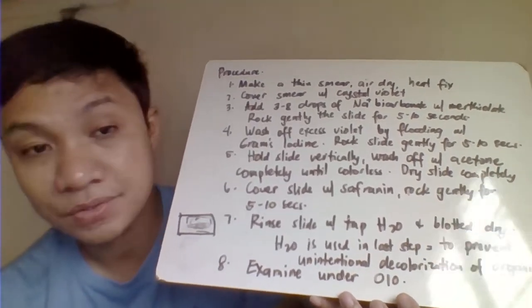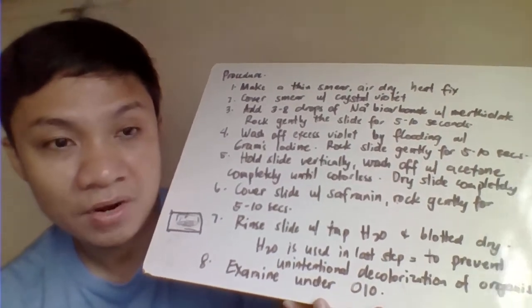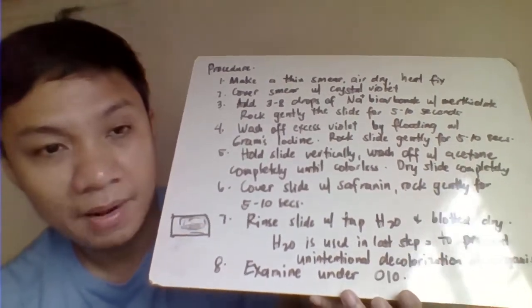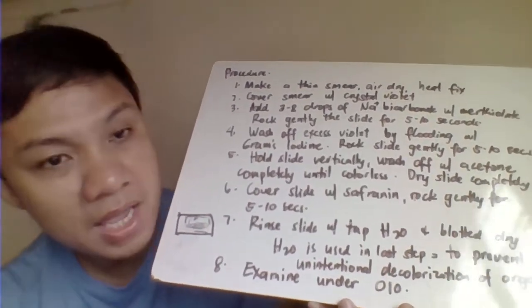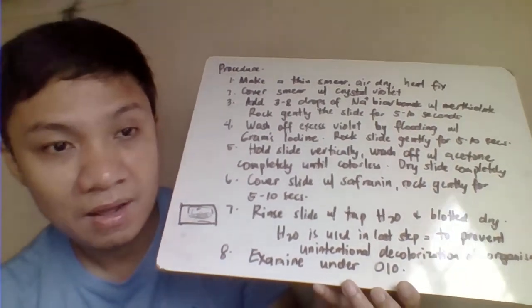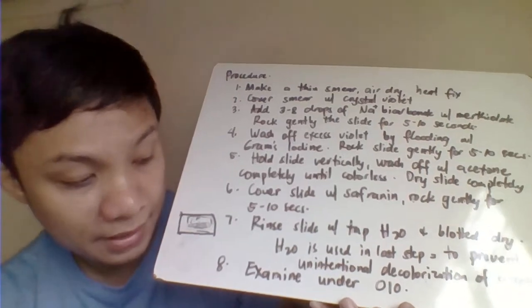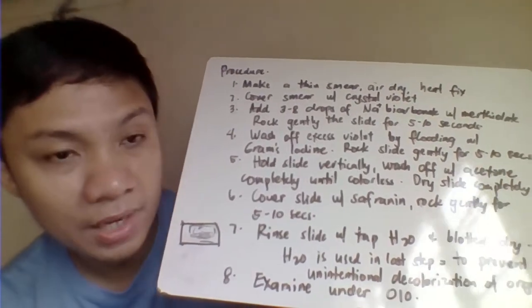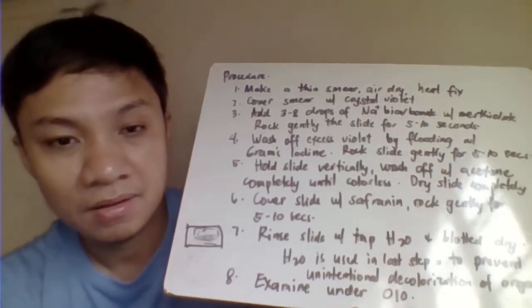These are also some of the things that you need to write in your gram stain results. So, like gram positive, cocci, in pairs, in chain. That is how we do our reporting. Or gram negative, bacilli, diplobacilli, something like that. Okay, dry examine that one under the oil immersion objective, because this one is a dry smear. Okay, so thank you.